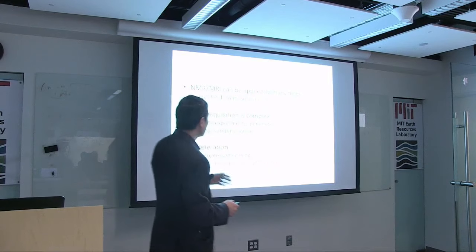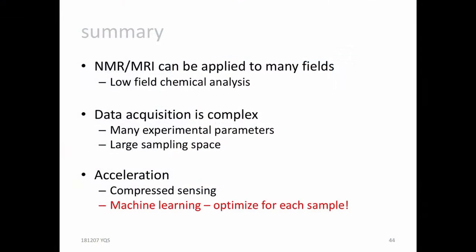And so what I want to talk to you about now, for the next 5 minutes, is an approach that's based on statistics, that lets the computer, or the tool, the instrument, decide what parameters it should use.